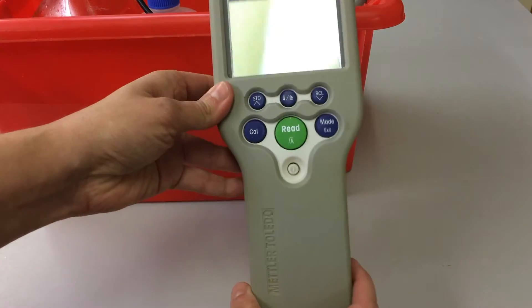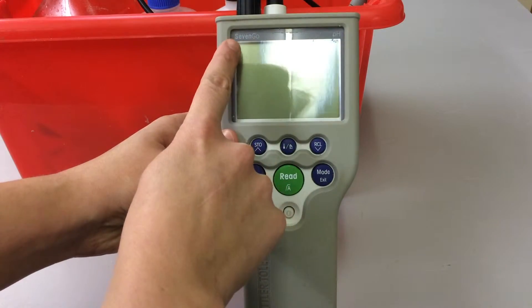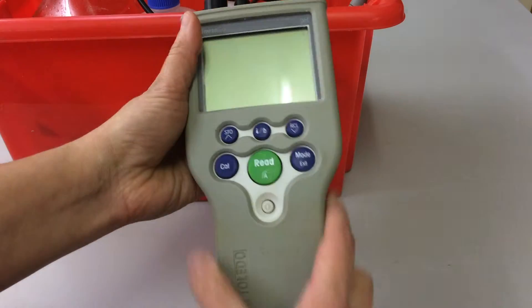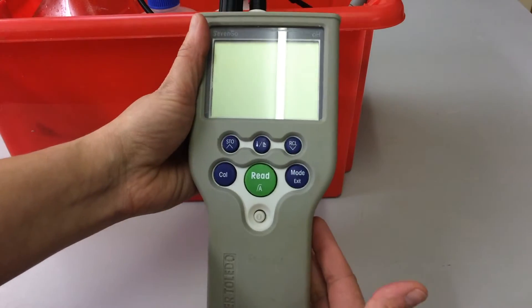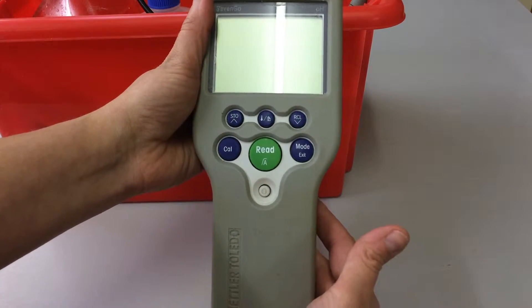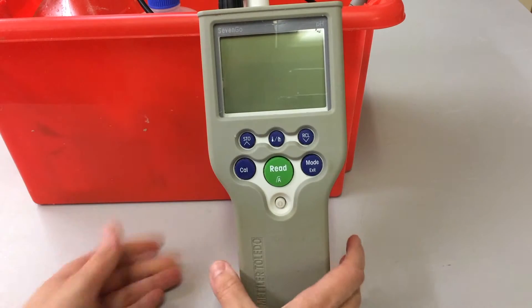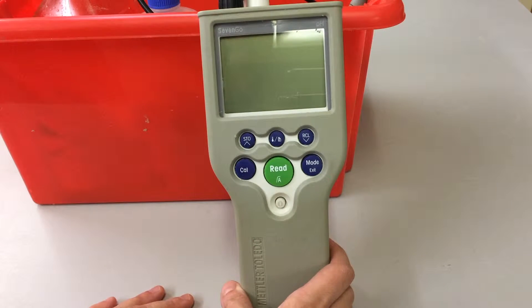This is the Mettler Toledo 7 Go pH meter. As you can see, it's a handheld device which is very useful because it means you can take it into the field or you can take it across various tanks that you may need to measure the pH in, so it's very versatile.